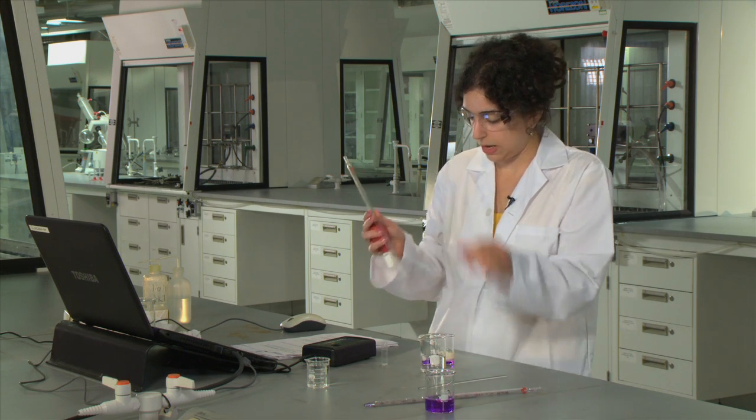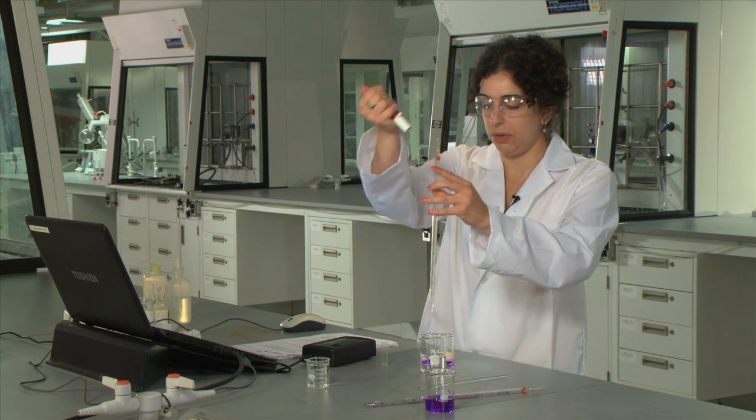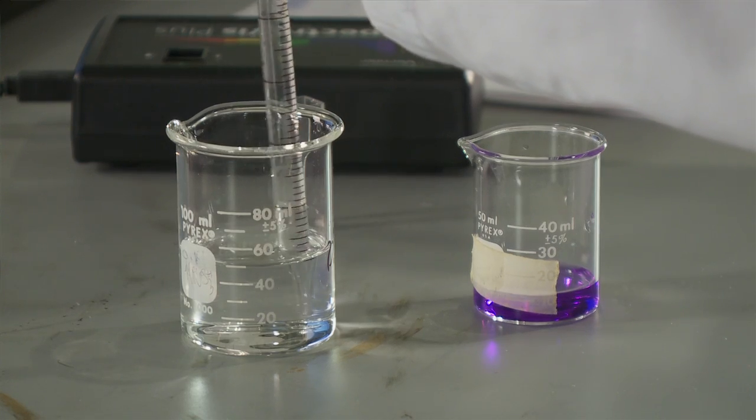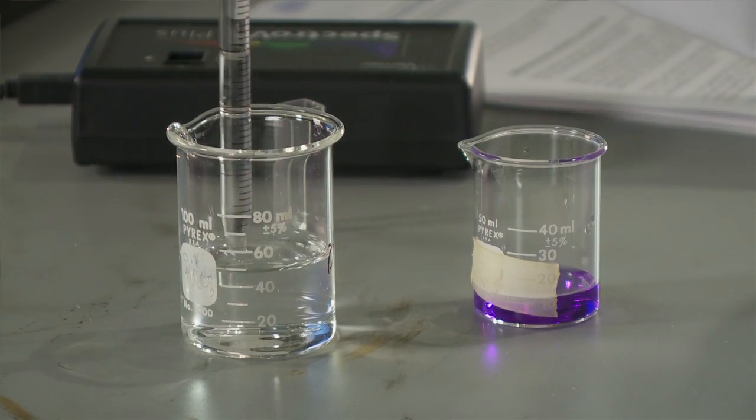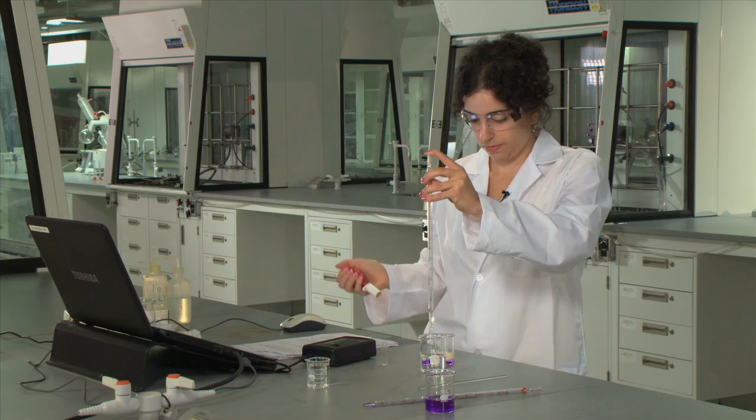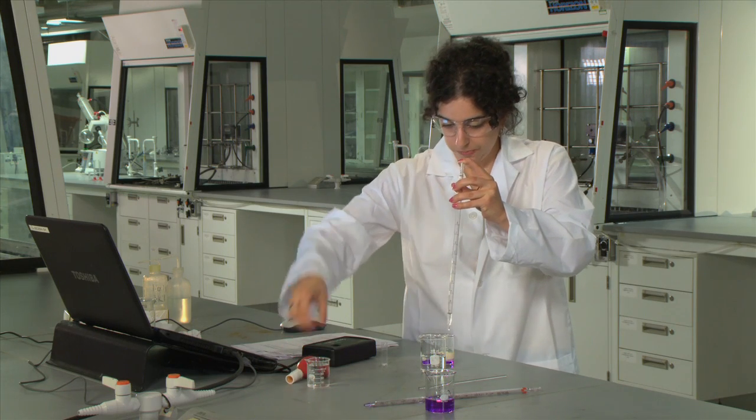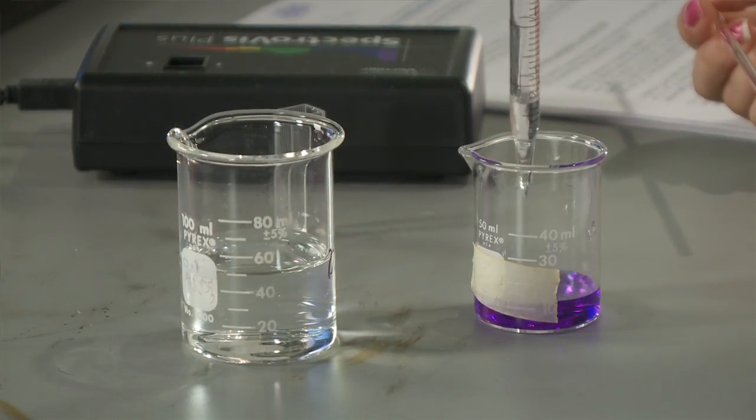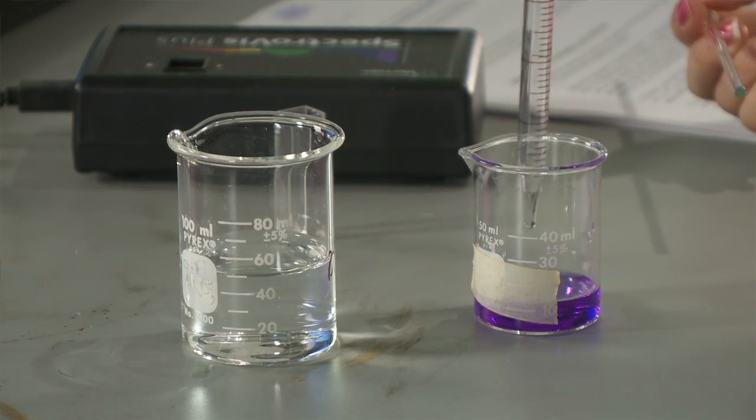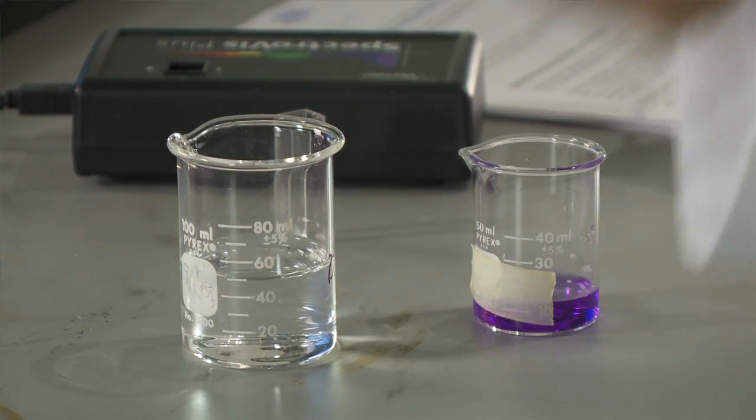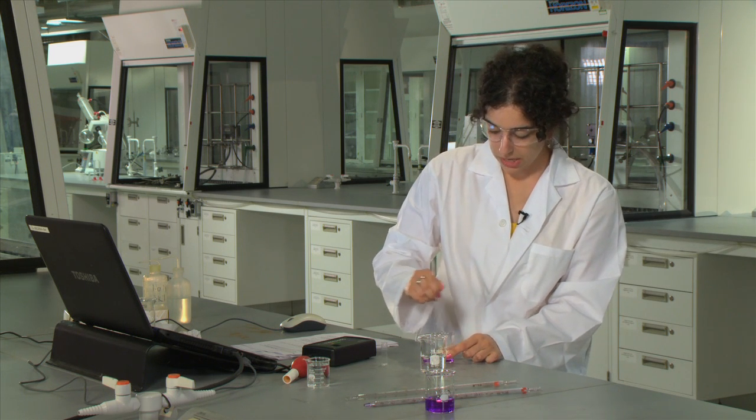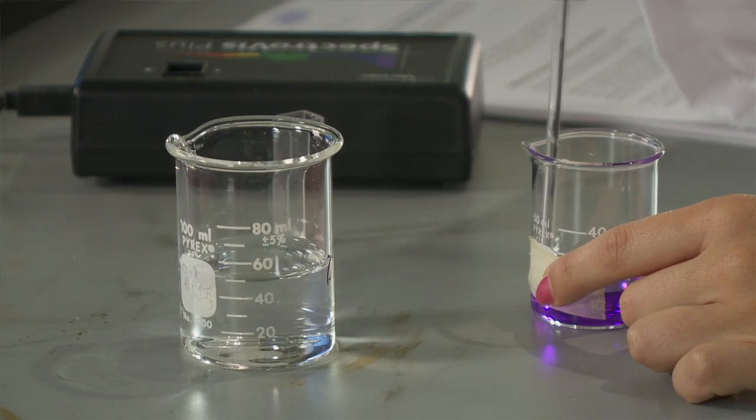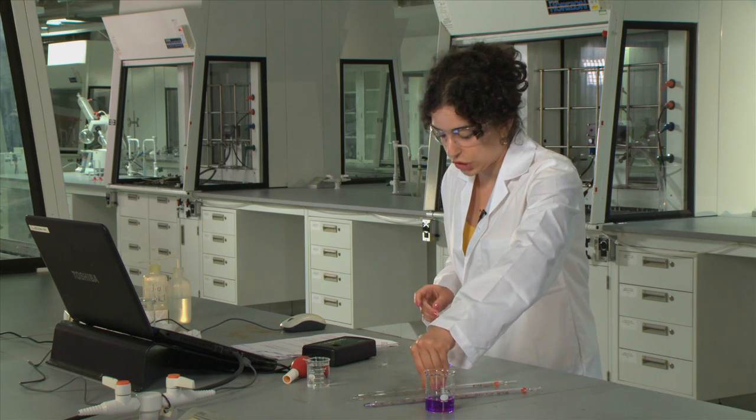And then to this, we're going to add one milliliter of sodium hydroxide. Now when you add the sodium hydroxide, you'll want to start timing the reaction. It's going to run for a total of a minute. In the first 30 seconds, mix the solution, and in the last 30 seconds, you'll just let it stand.